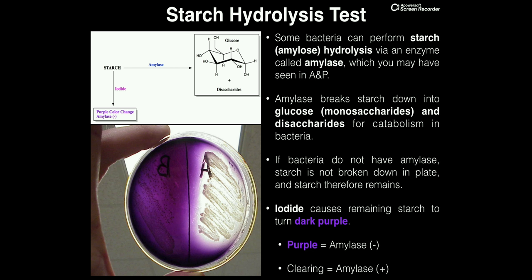On the left side B, this is the side where starch is remaining because all of it turns this dark purple color. That means the bacteria on the left side B do not produce amylase, because if they did, they'd be breaking the starch down. Since they don't produce amylase, the starch remains and turns dark purple. Therefore, because of this purple color change, we would say these bacteria are amylase negative.